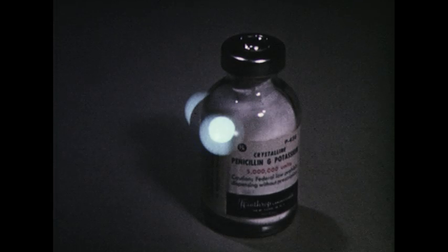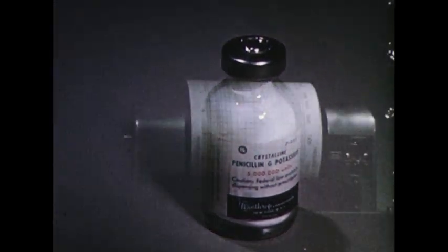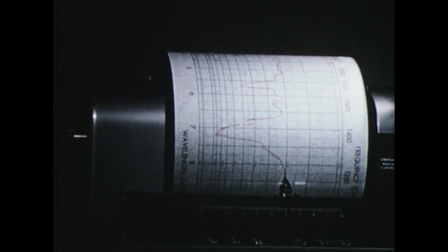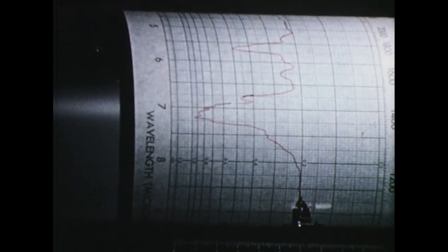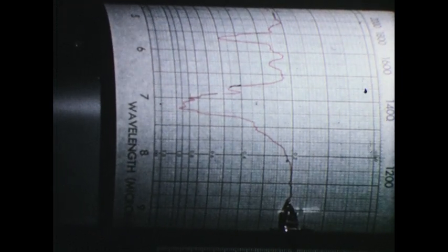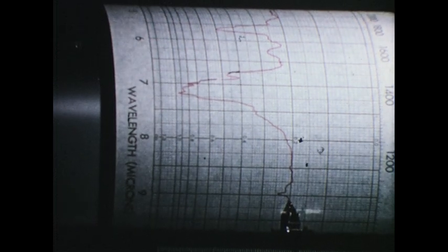Infrared spectroscopy has contributed much to the progress of science. It has given us insight into the structure of such simple molecules as water and carbon dioxide, and such complex molecules as penicillin. It has provided a new and rapid method of analysis and control. To modern science and industry, it offers both an eye to the unknown and an eye to the future.